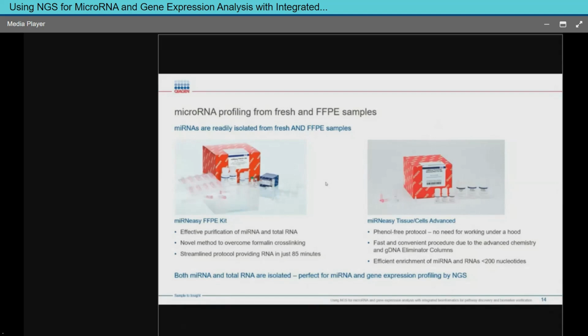And then we can think about taking the most differentially expressed ones with a good p-value and moving that into a real-time PCR or digital PCR test. But we'll still need more samples to go through and to verify that.